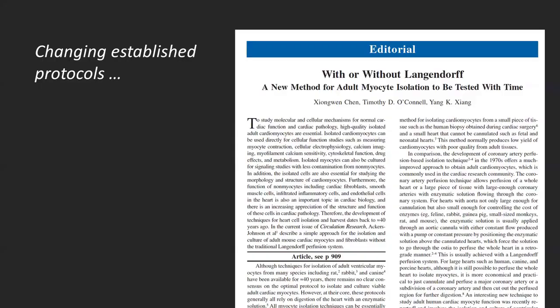So when this paper came out, there was an editorial in Circulation Research, and it was called "With or Without Langendorff: A New Method for Adult Myocyte Isolation to Be Tested with Time." Because obviously, changing established protocols such as the Langendorff is not easy.